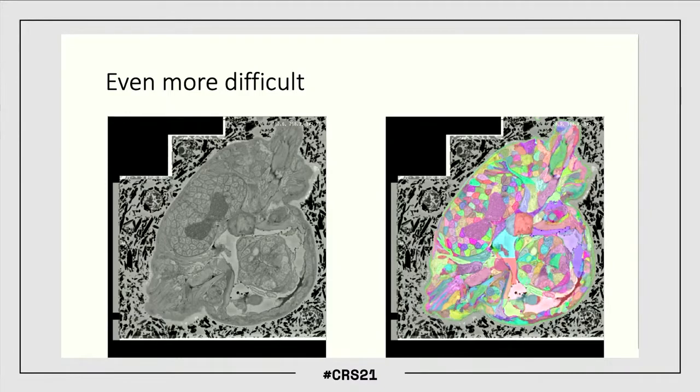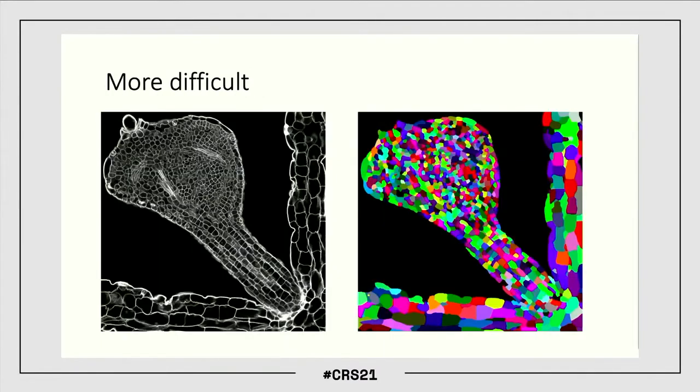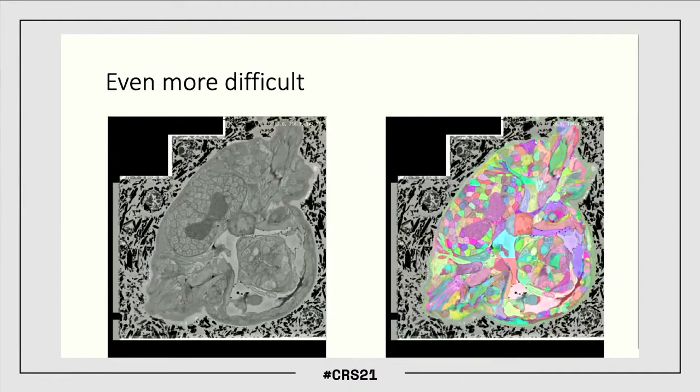Especially the segmentation problem when you have to go from the boundary information, like in the one that I just showed. So you see here the boundaries are labeled, and then this is where the objects are. And then also in electron microscopy, as you will see later, this is also a boundary-based segmentation problem.